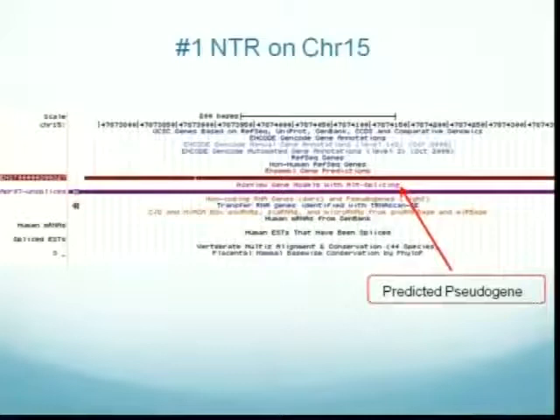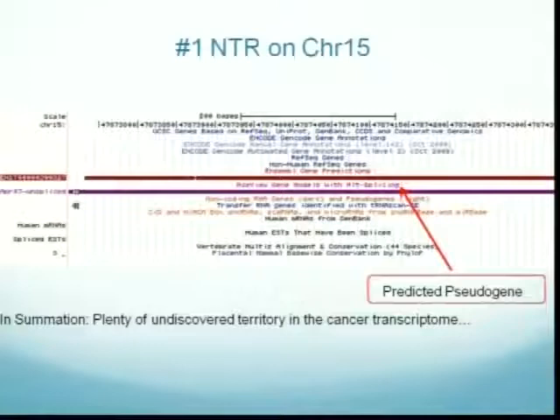But in the ENCODE project, they didn't see the various levels of histone markers in the surrounding regions. So I would imagine that if this is really the promoter region, you probably will see some histone H3K4 markers. Yeah, you should. I have not cross-referenced this data against H3K4, but that's a great idea. Probably those kinds of tracks can be put open. Oh, yeah, they could. As with any next-gen analysis, you really need one person dedicated full-time to each analysis. Probably more. There you go.